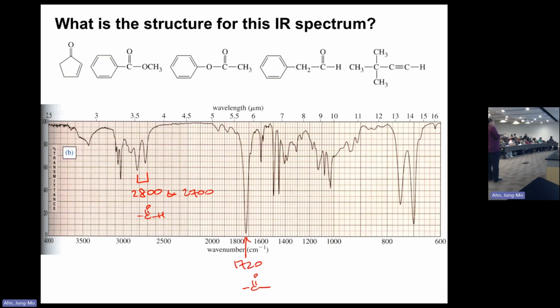For instance, there's a 3000 line right here, right? We've got peaks coming above the 3000. What does that mean? The molecule has a double bond, so there's an unsaturated carbon signal there. And then the peak at 1600 is typically very characteristic of benzene. So along with this unsaturated signal, we could reasonably say there's a benzene, unsaturated carbon in the molecule. So this aldehyde must have some kind of double bonds, probably benzene because of the 1600 signal.